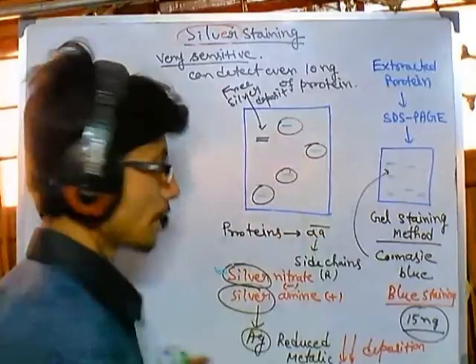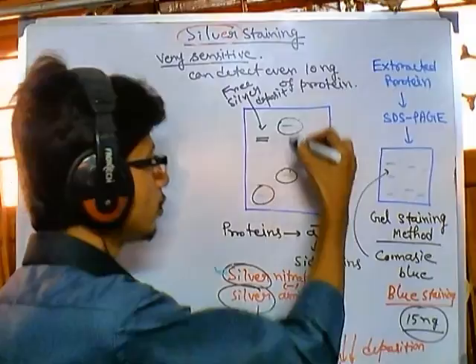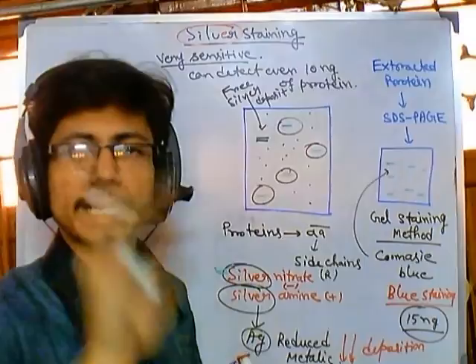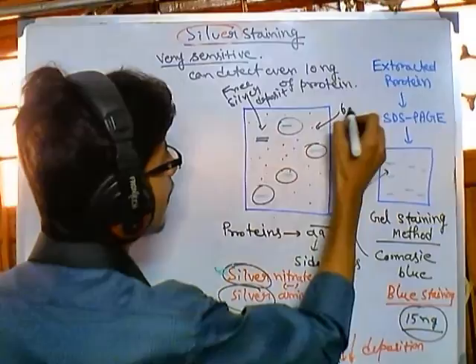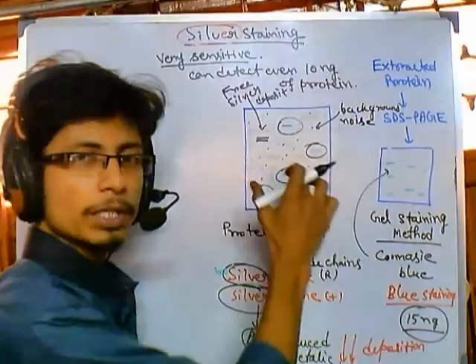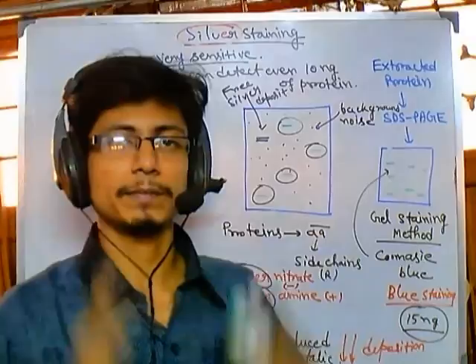But again, another important thing: because the protein migrates through this gel, there are some traces of proteins in this region. That's why we get some scattered deposition of silver in this case. But these are not that dark, just small dots, small scattering. This small scattered silver deposition throughout the gel is called the background noise. We need to reduce this noise, because it is not the right indication of proteins. The protein bands, if present, are given by a dark band, but this background noise is very faint, very less.